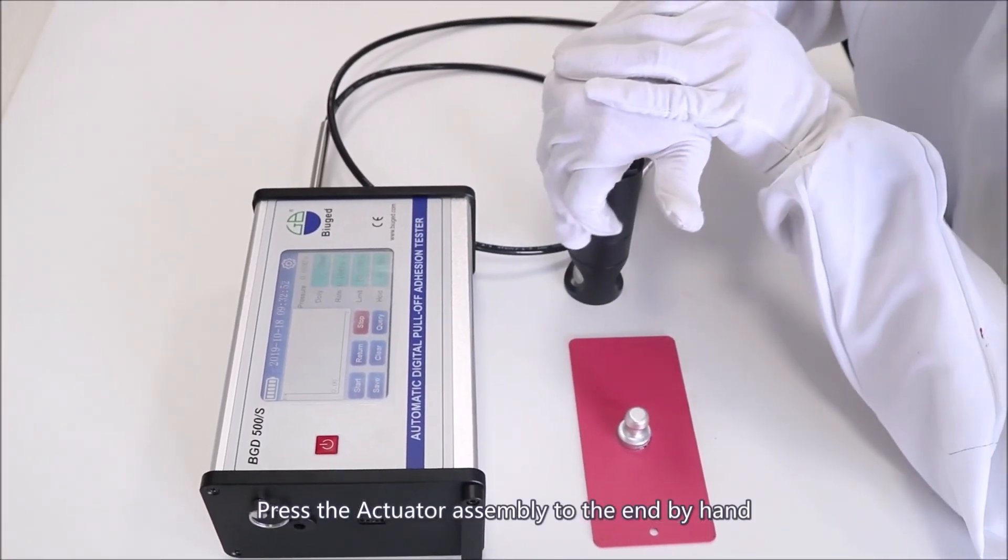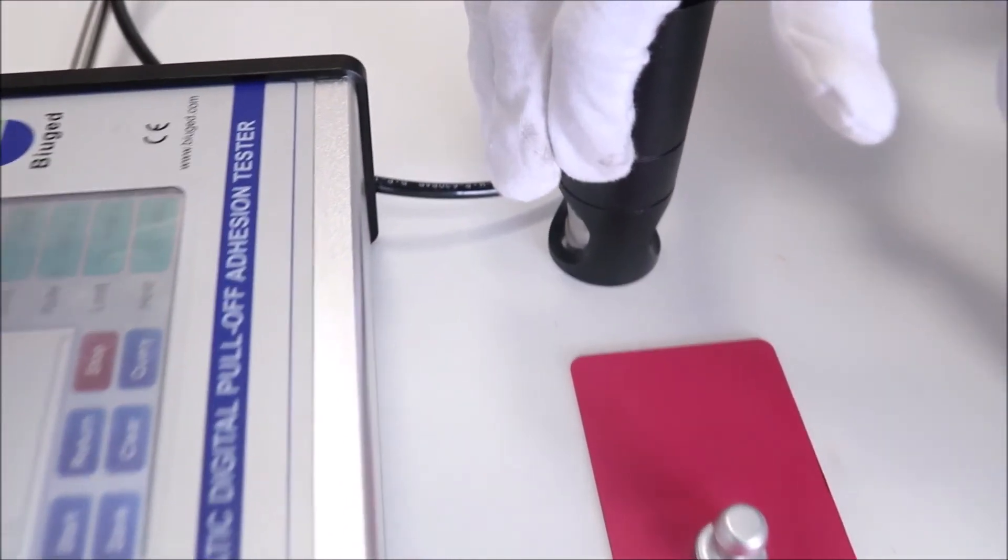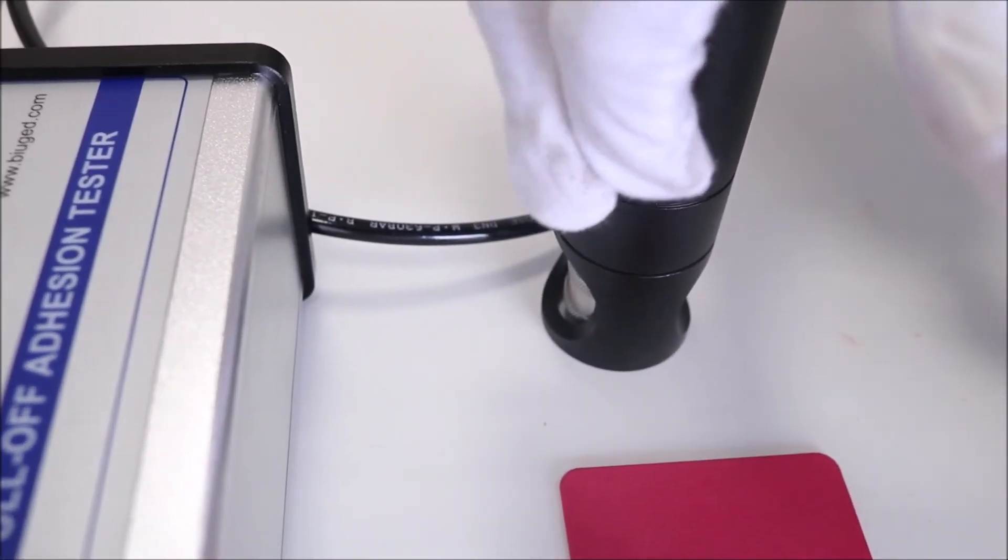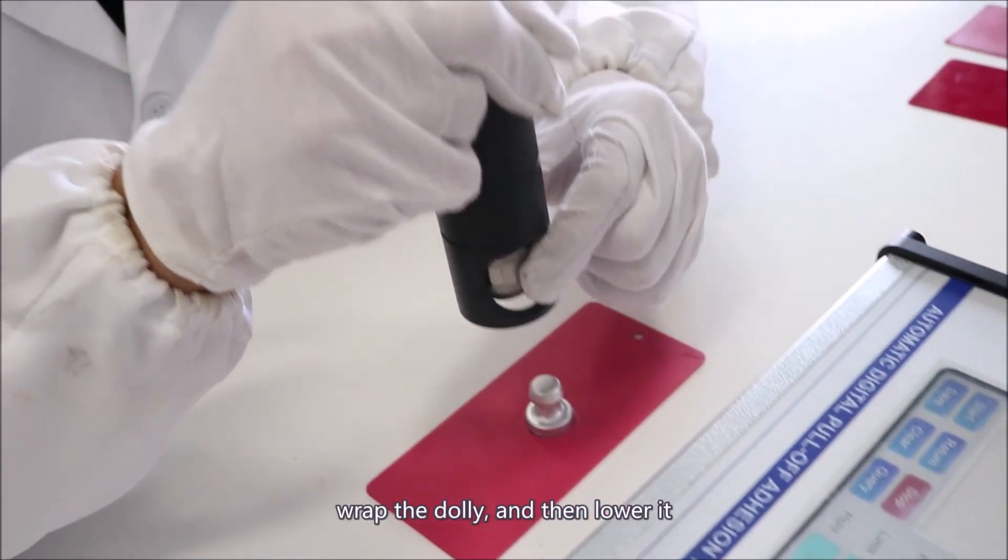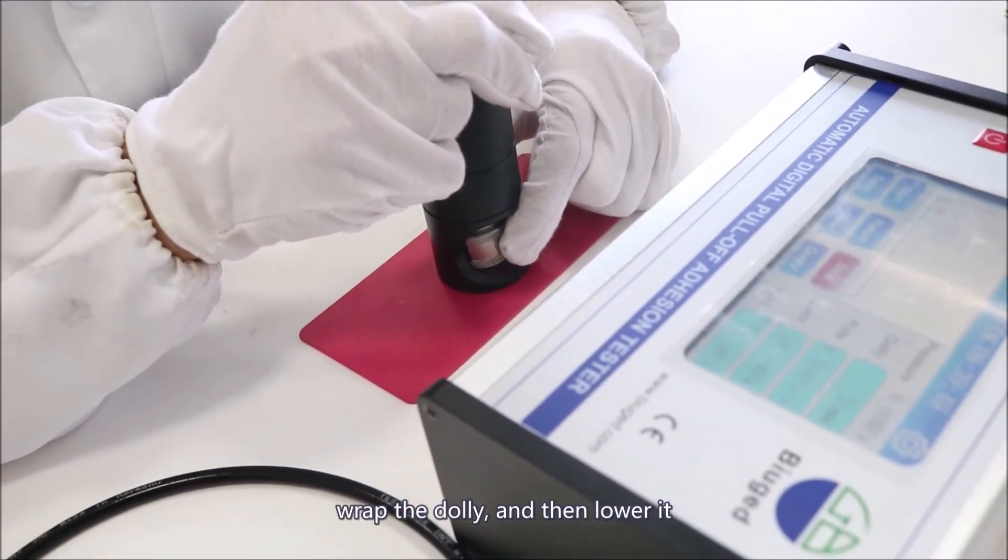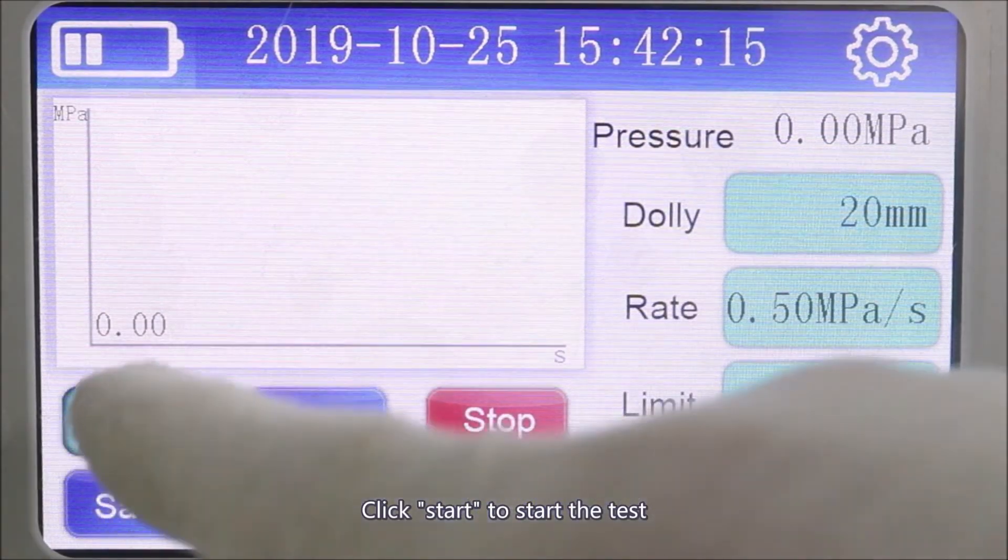Press the actuator assembly to the end by hand. Make the quick coupling up by hand, wrap the dolly, and then lower it. Click start to start the test.